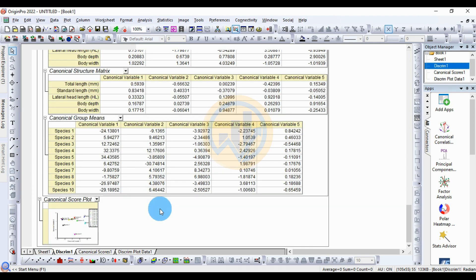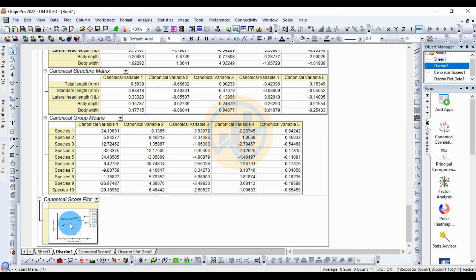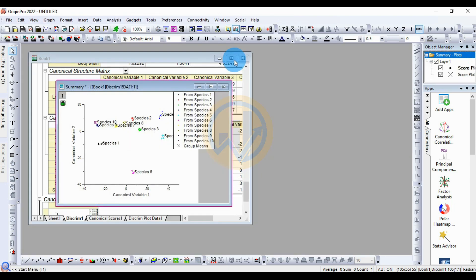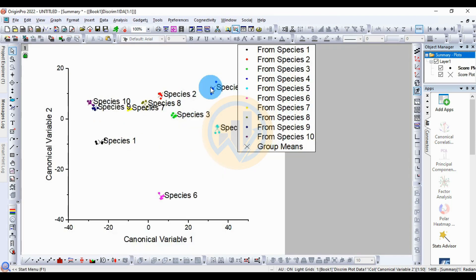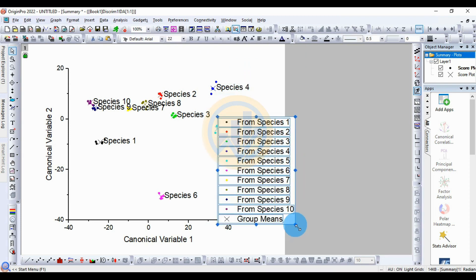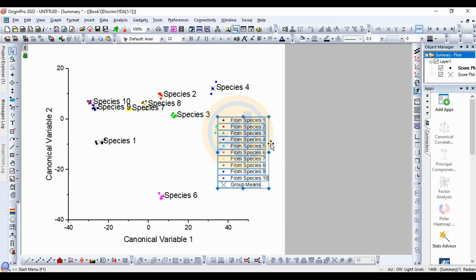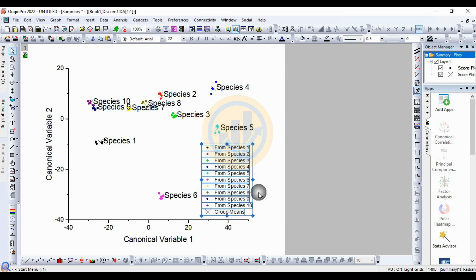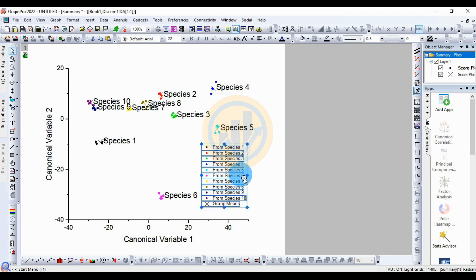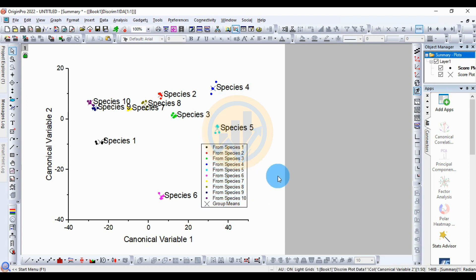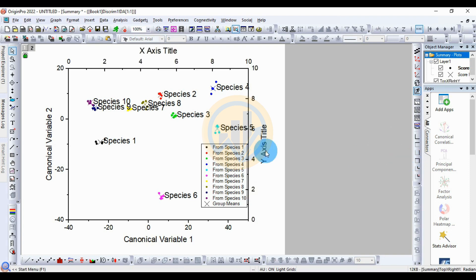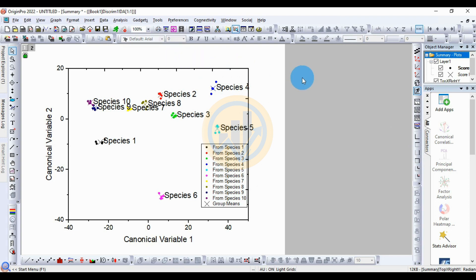Finally, for the canonical score plot, double-click to open the plot in a large view. This is the canonical score plot. Arrange the graph by deleting the Y-axis numbers and the X-axis numbers.